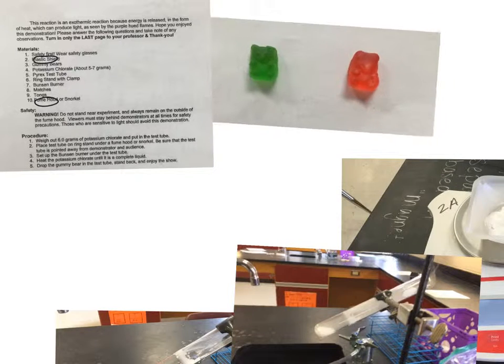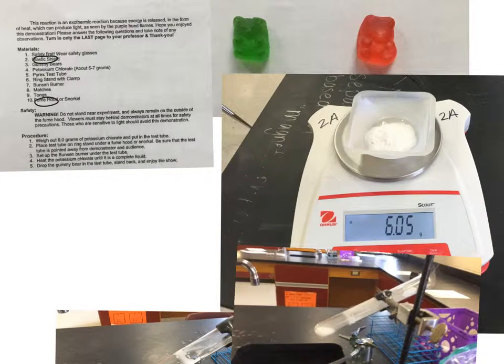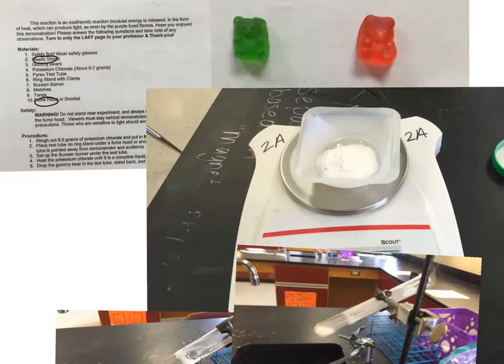So here are the gummy bears that we're going to be using. The video will not include the red one. You will see what happens with the green one. The red one I have already given you data for. Here is our balance. You can see what the potassium chlorate looked like beforehand. So it's a white powder.